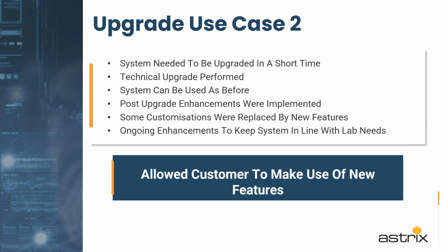So the immediate step for what we did was a technical upgrade, and the client was able to use the system as before. After the post upgrade, we implemented the enhancements to use the new features. It was a step-by-step process. Some of the customizations were replaced by the new features, and it's still an ongoing project to make sure that the system is in line with your new lab needs.